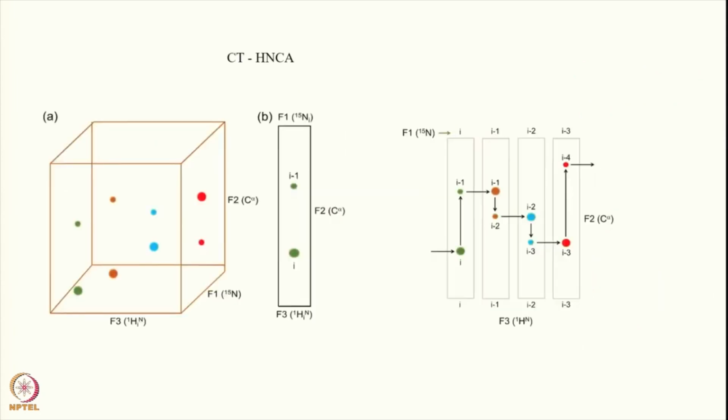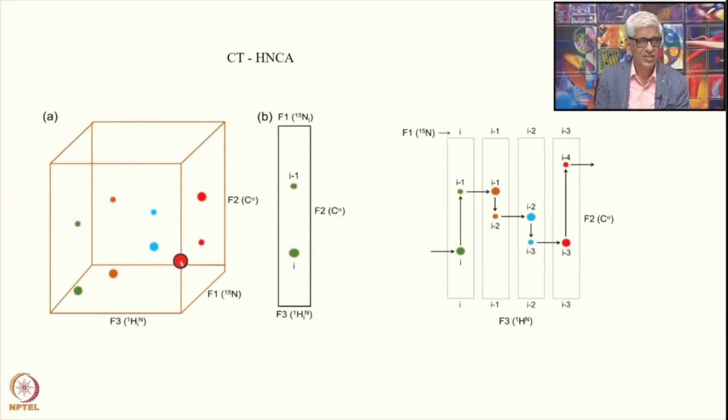Okay. Now let us look at this spectrum. How does it look? This is what I indicated to you here, and here you have the schematic spectrum of a particular sequence, where some 4 amino acids are taken randomly. So how many amino acids are taken here? There is one green, one red here, then the cyan, and then another red here, this is brown. Now each one of them has a strong peak here, and then also a peak at this point. Each one of them has that. So it is indicating, as I mentioned to you earlier, that you generate a self peak as well as the sequential peak, which is the peak of residue I minus 1.